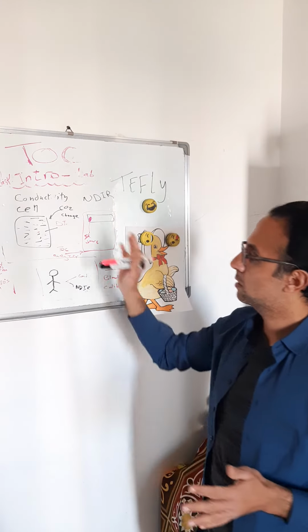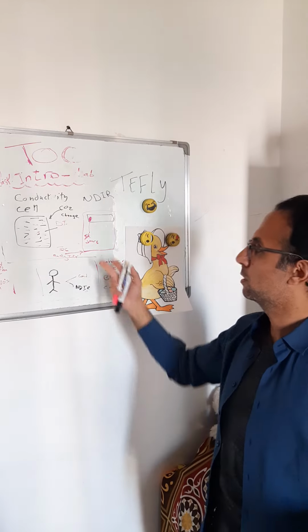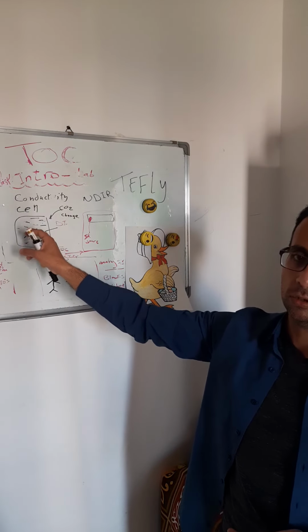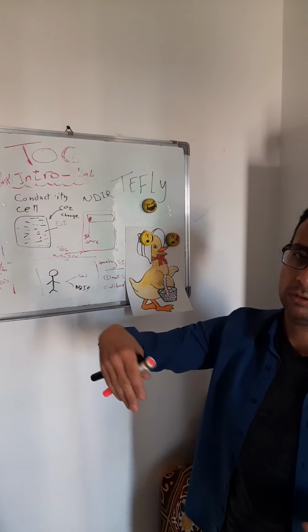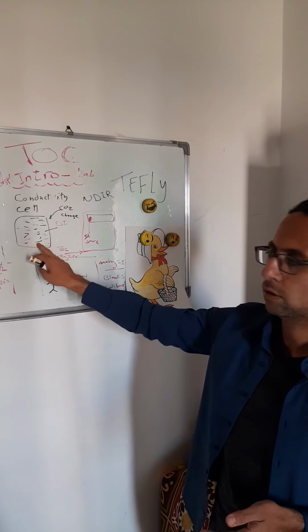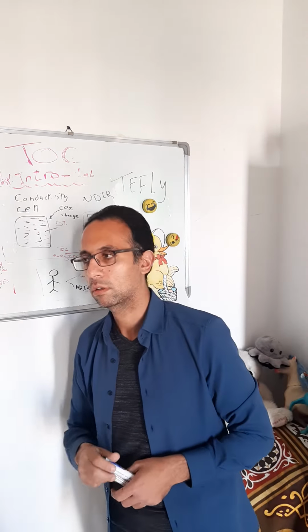When CO2 is released from our samples due to organic carbon, of course, the CO2 changes the conductivity of this DI water, deionized water, which is typically stable. It changes with the introduction of the sample, analysis, and detection step. This change is directly measured by the instrument as a reading that converts to concentration.